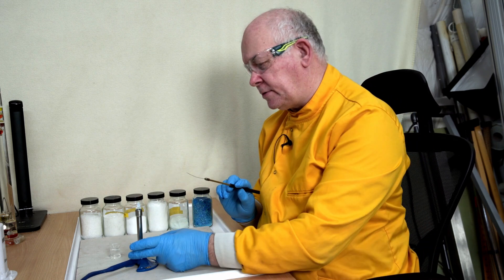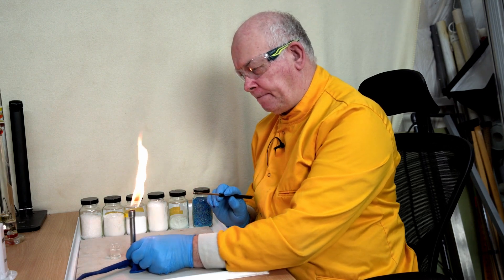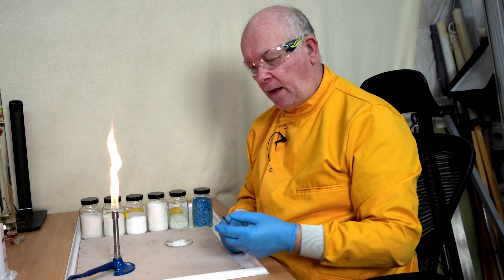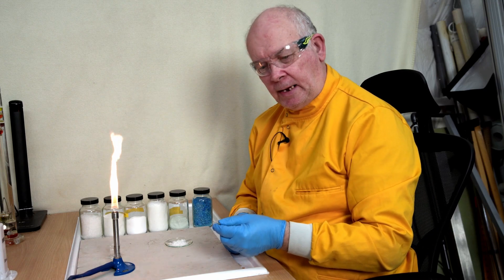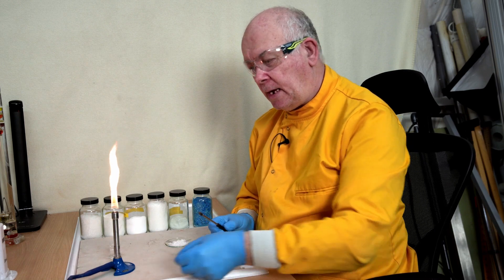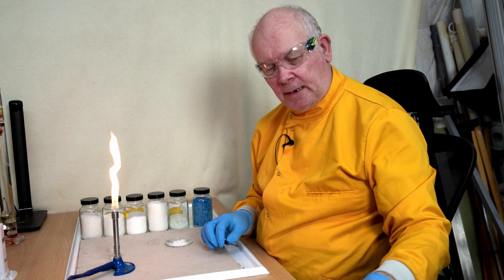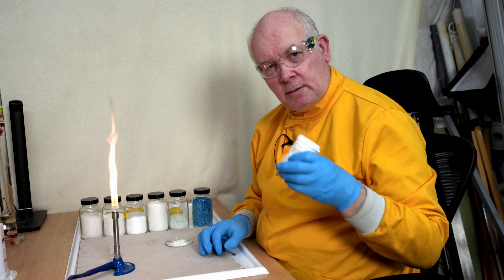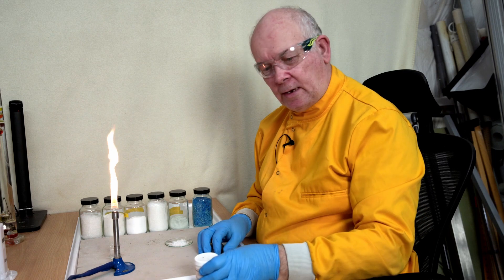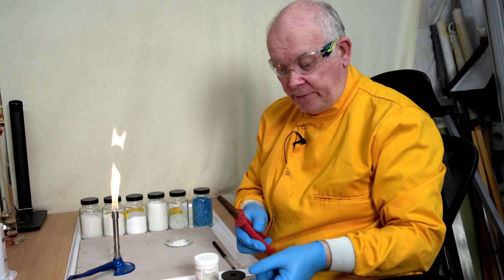Now to work out what this substance might be, we need to compare it with some other substances and check them against the colour we saw. It's a red colour, and I know something else that is red - this is lithium chloride, or just really lithium.